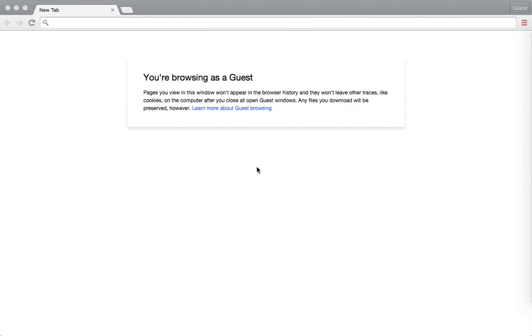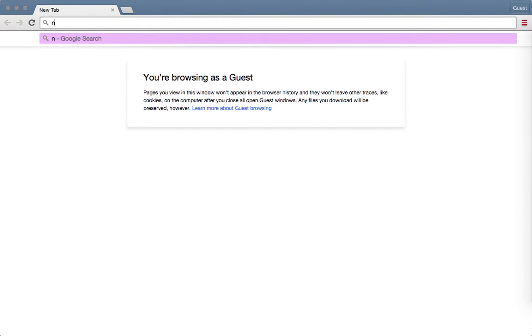I'm going to quickly show you how to use the 1000 Genomes browser to search for genes. Let's start by Googling the following: NCBI 1000 Genomes.